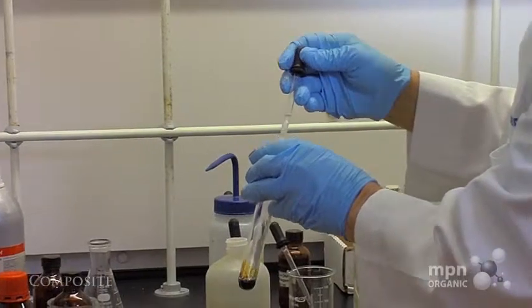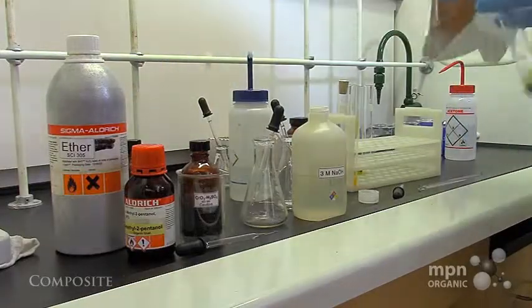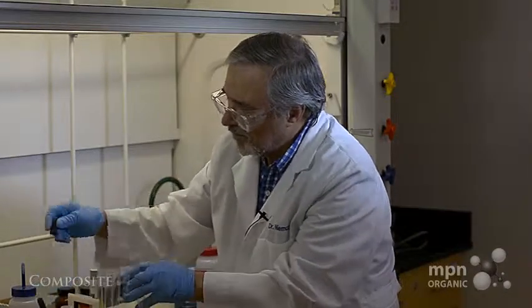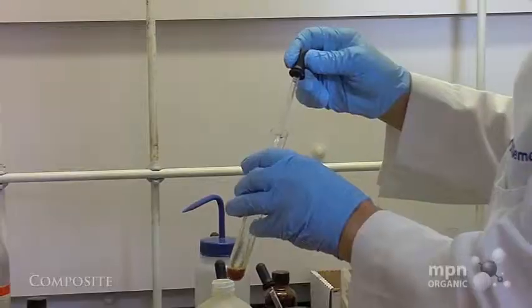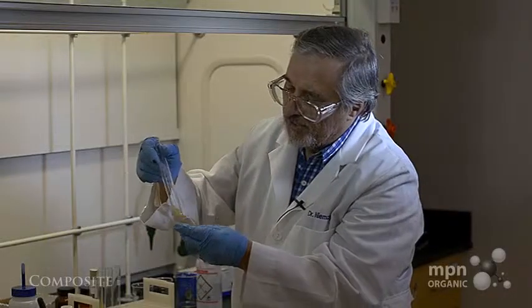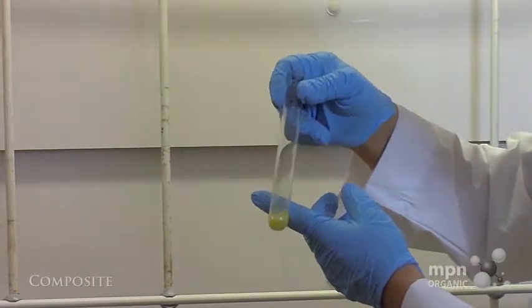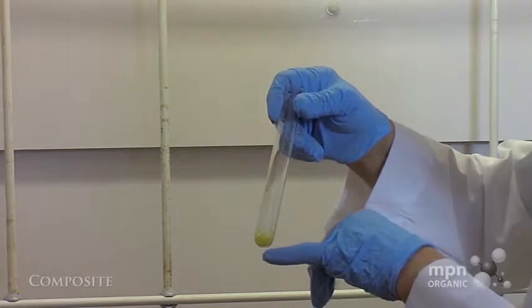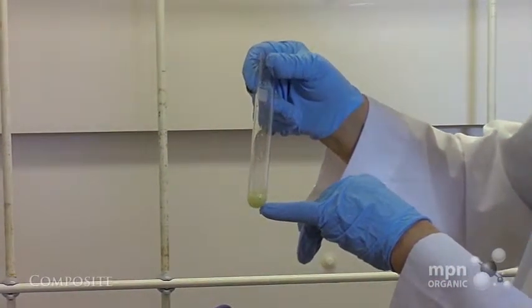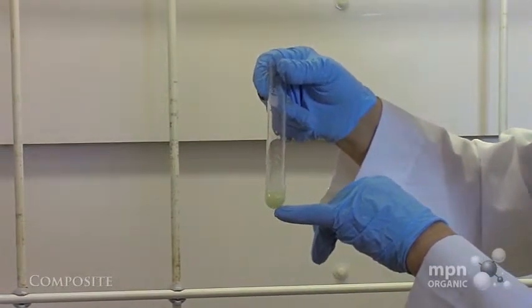Okay. Let's bring this over here. Okay, it's starting to get that milky consistency. Okay, and you can see that there is a yellow solid that in fact is, as predicted, settling out to the bottom of the test tube.